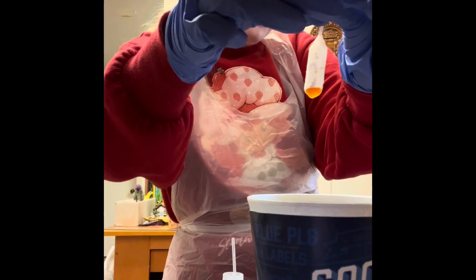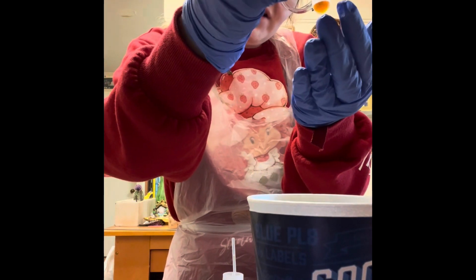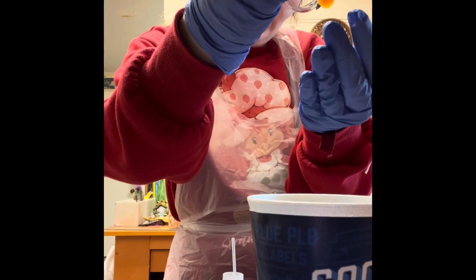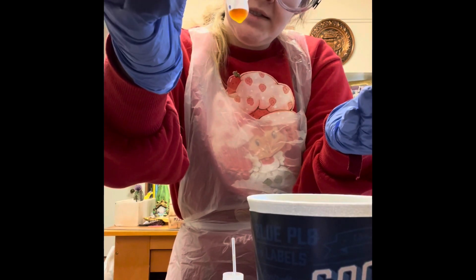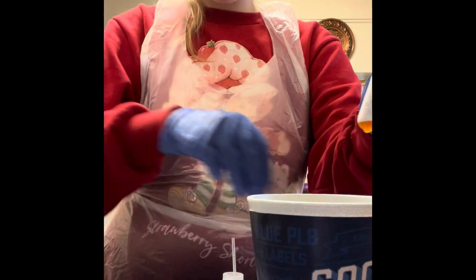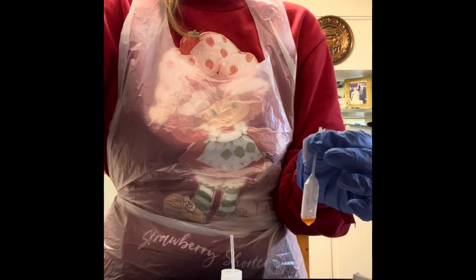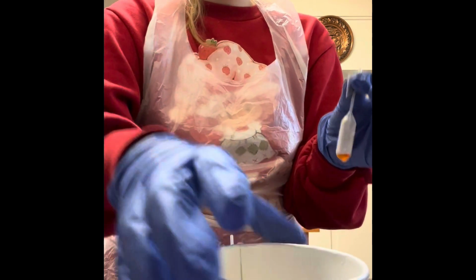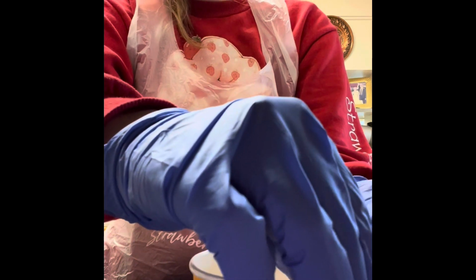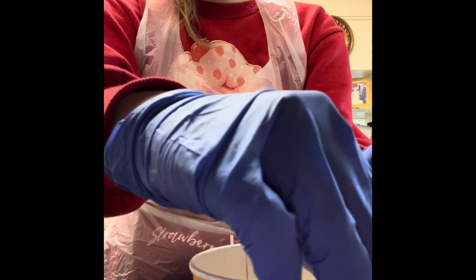And I'm also seeing some clumps where it's not all liquid, if that makes sense. There are also solids in there too. So that's an interesting observation. Now that I'm done with my ice bath, I'm going to start with my hot one. I'm going to put it in there and tape my pipette down.